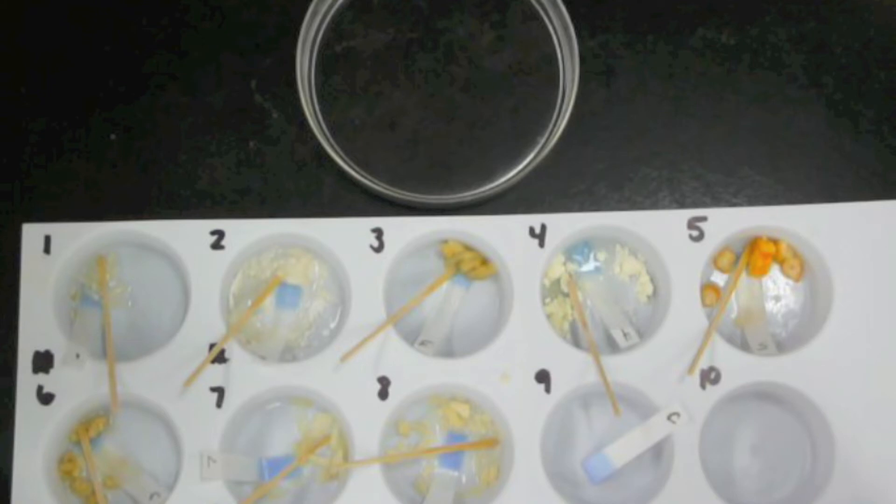Now we will move all the strips into the vinegar and alcohol developing solution. This will show us whether the food contains protein or not.